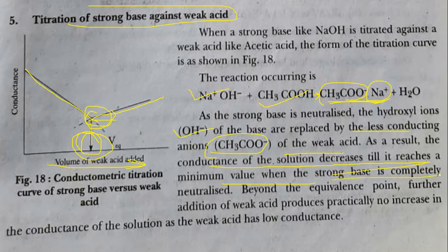When the strong base is completely neutralized, beyond the equivalence point, further addition of weak acid produces practically no increase in the conductance of the solution, as weak acid has a low conductance, and the conductance increases at a very slow rate, or that is equivalent to no increase. So from here there is a sharp down, but from here no sharp up is observed. Hence we can find out the point of intersection, the equivalence point of the titration.